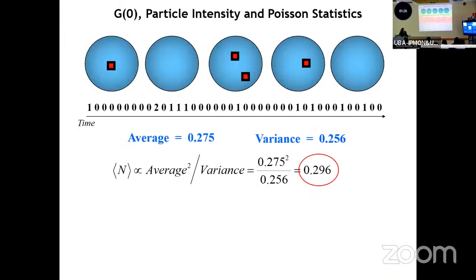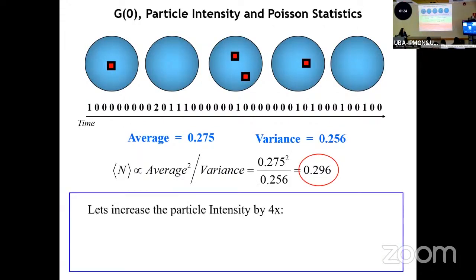How does it affect the observation if the intensity increases by a factor of 4? You can easily increase the brightness of the molecule by increasing the laser power, right? We can go from very dim to very high intensity if we crank up the laser.